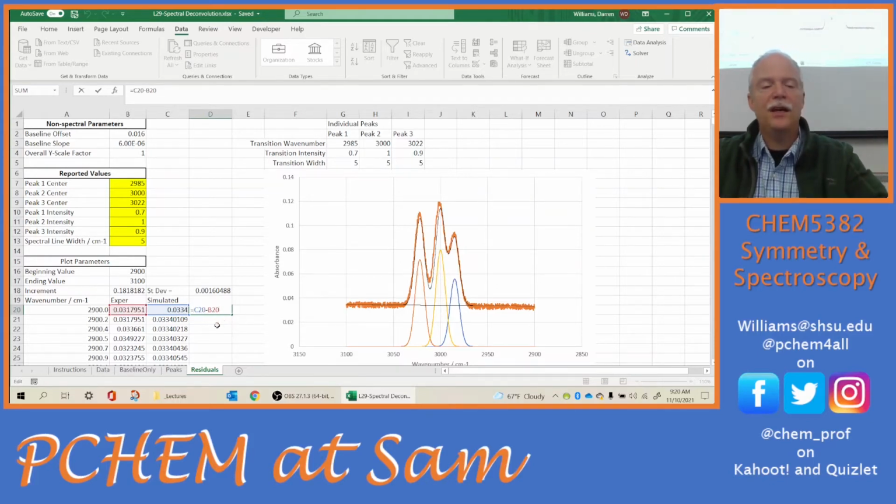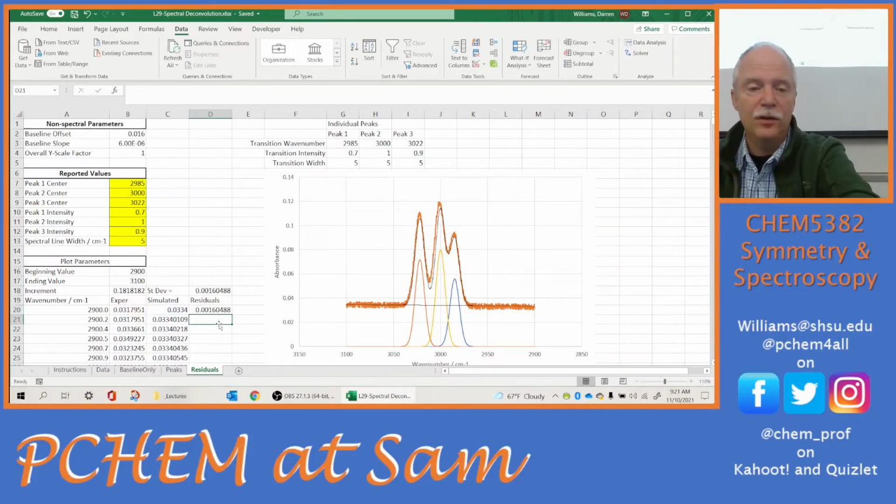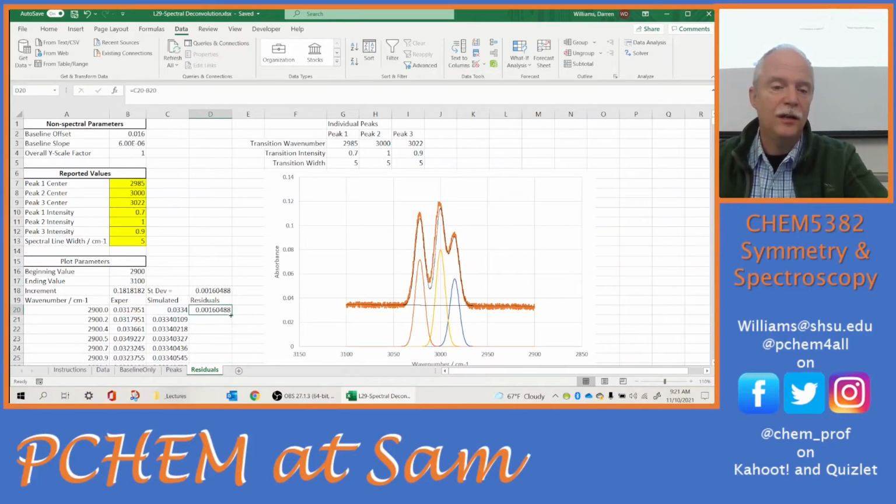Now, we always take our... pardon? Sorry, I was thinking out loud. If you take a difference, you just take a deviation. Yeah, that's right. So this is a deviation, and we would take a mean value and compare our x value to the mean. We'd take differences. So we're going down that exact same road. Okay, and so I'm going to go ahead and copy that down, and I have all of these residuals. But notice some of them are positive and some of them are negative.